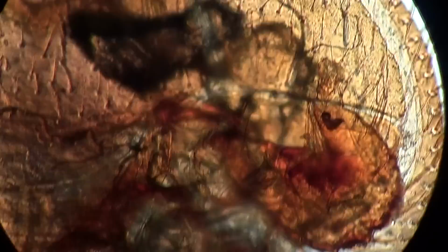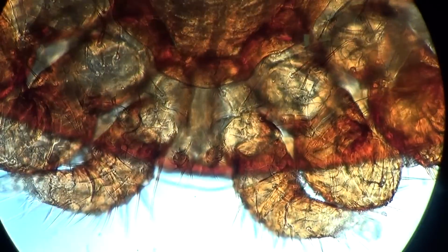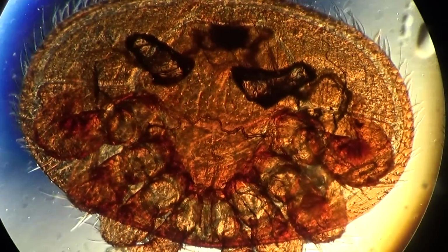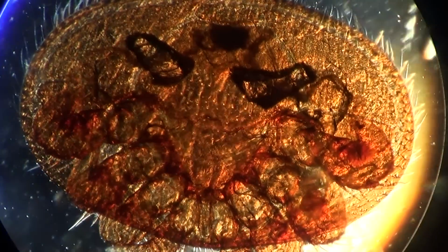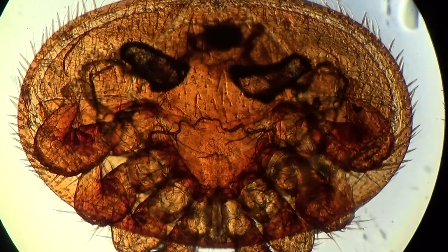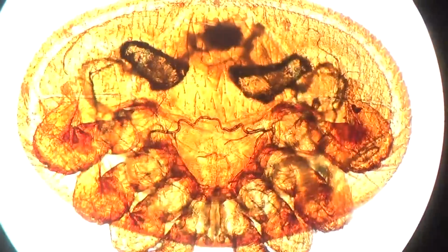Well, now the smaller magnification, 20, so total 200. Again, this is the sucking apparatus with legs. Smaller magnification of 10 with a total magnification of 100. So that's a short story about my most dangerous pest of the honeybee, Varroa mites, how it looks, how it's developing, and a little bit about its biology.